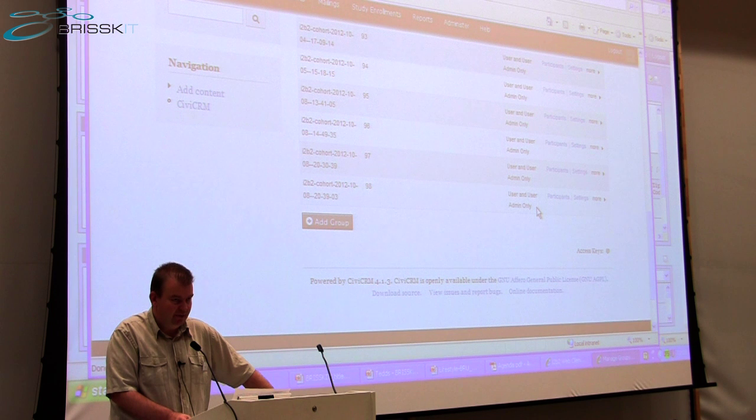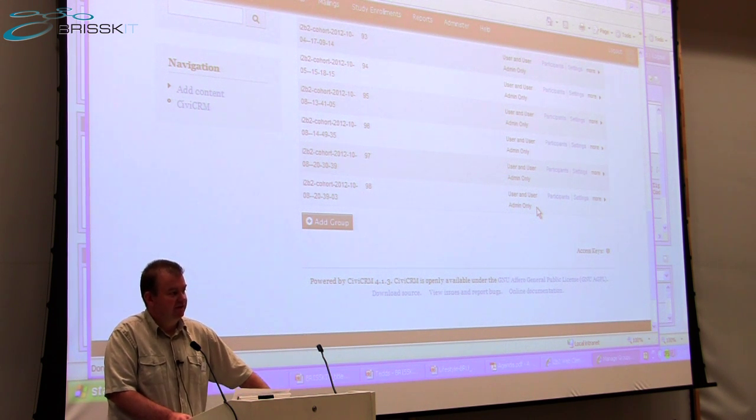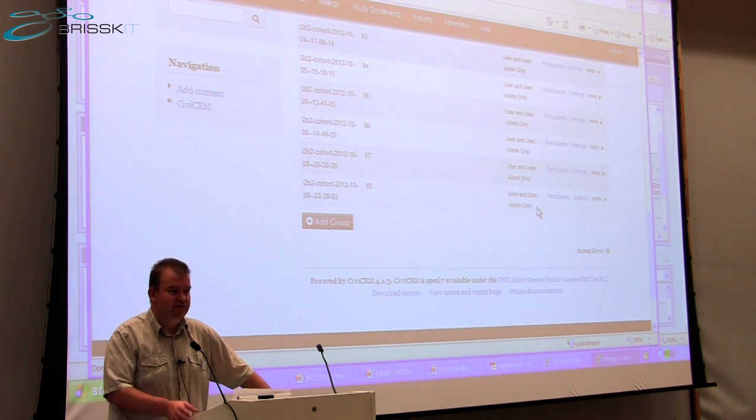One final example from our own use within the BRU, the CiviCRM Drupal install that we use to drive the GenVasc recruitment has LDAP integration directly into the hospital's Active Directory. So all of our staff just log on effectively at single sign-on. For those staff who are within the appropriate security groups, have access directly into CiviCRM and are able to create and manage participants with the same password that they use to log into their hospital network account.